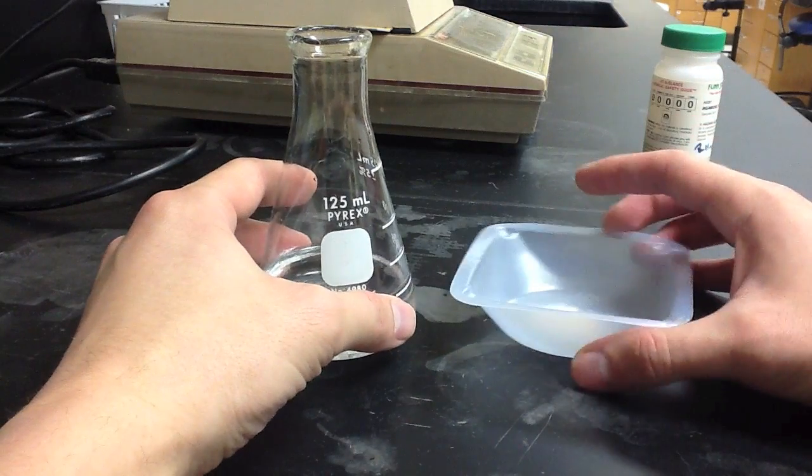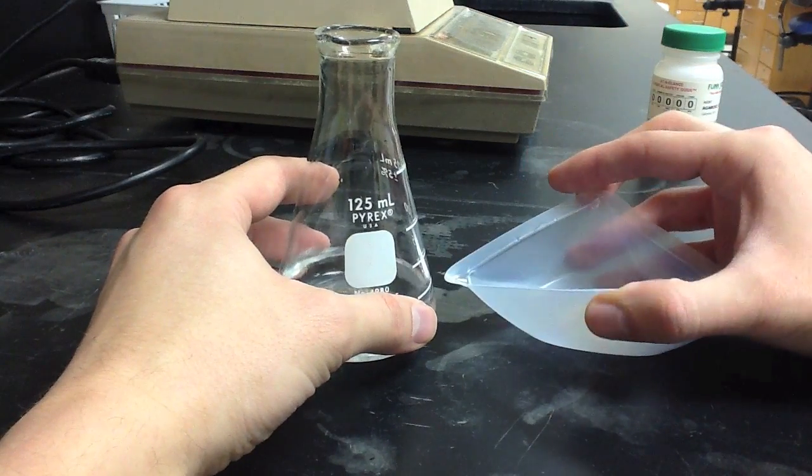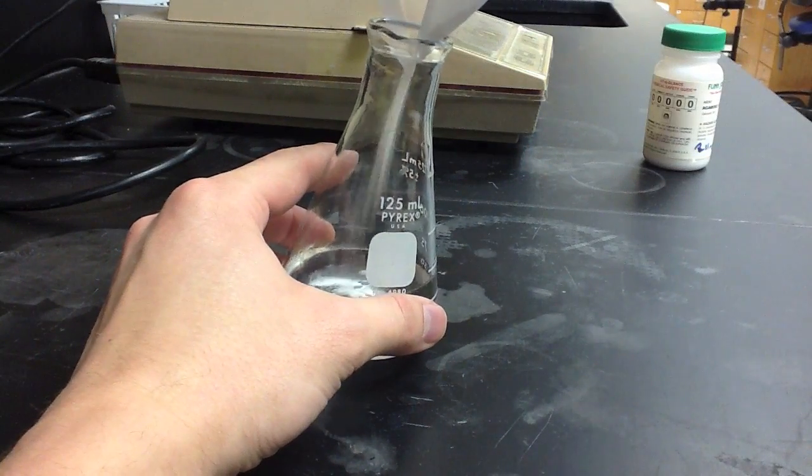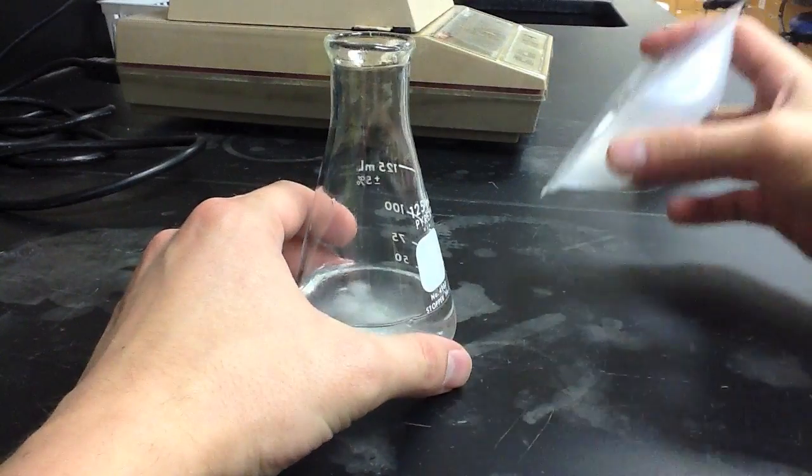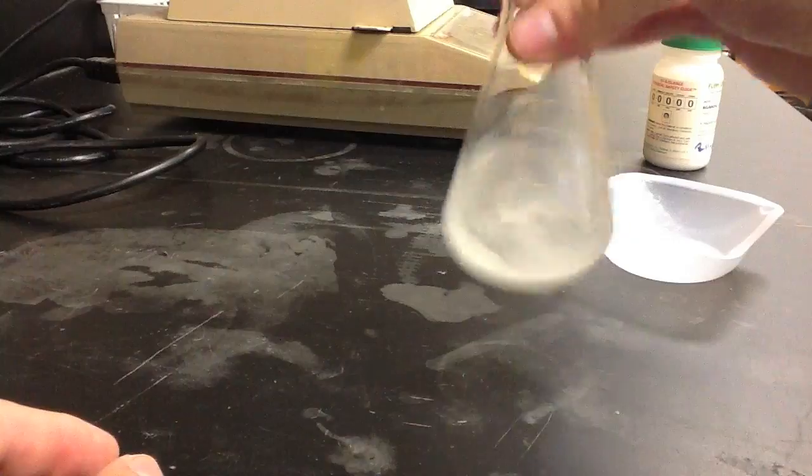To first make the agarose gel, we add powdered agarose to 1x TBE buffer. We'll then mix the solution as best we can and heat it to boiling in a microwave.